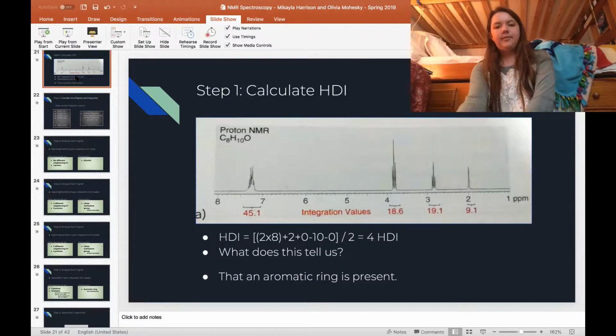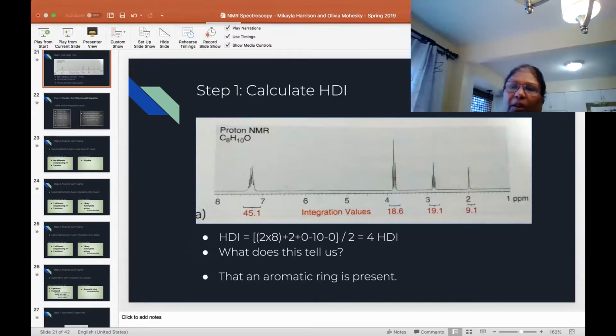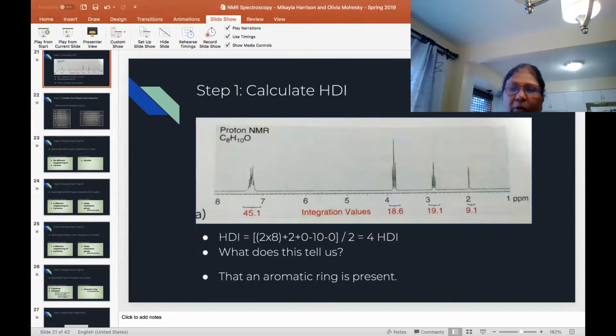Any questions about that? Or I'll go back to the thing. Please ask questions because you'll be doing something like this for your post-lab. It's not hard, but you have to look at every detail, especially piecing together, like a puzzle. You have your individual fragments, and then you have to keep the splitting pattern in mind when you put it all together.